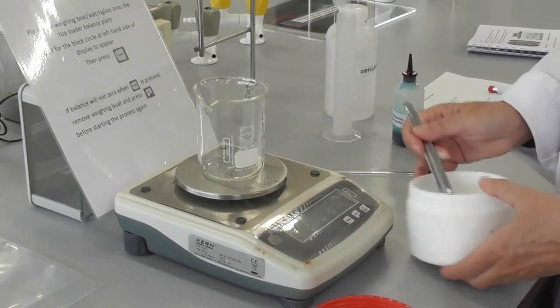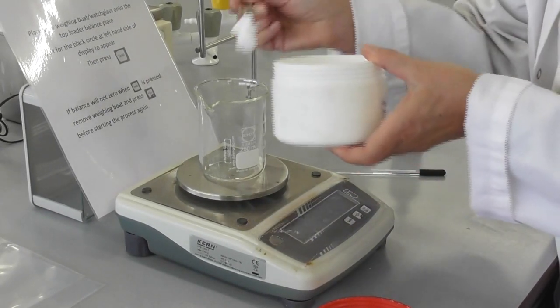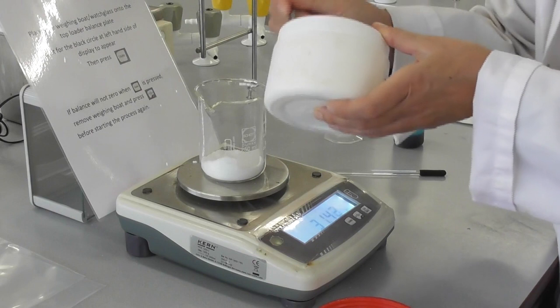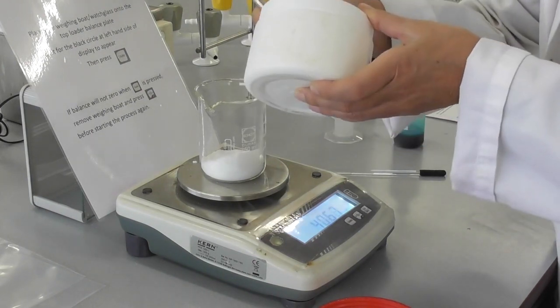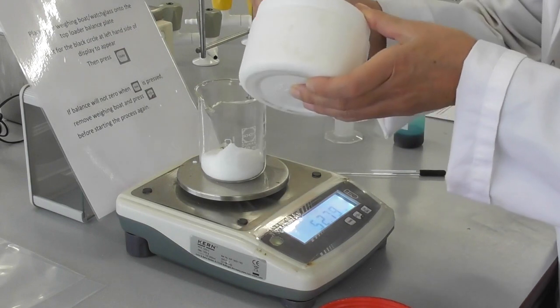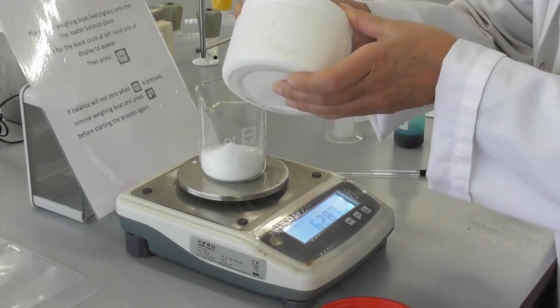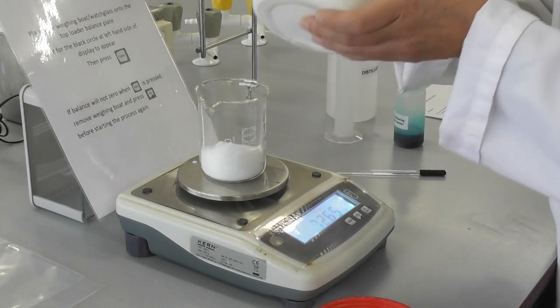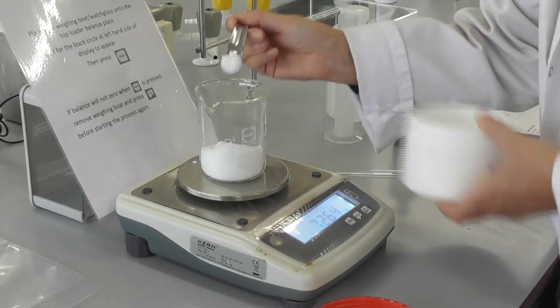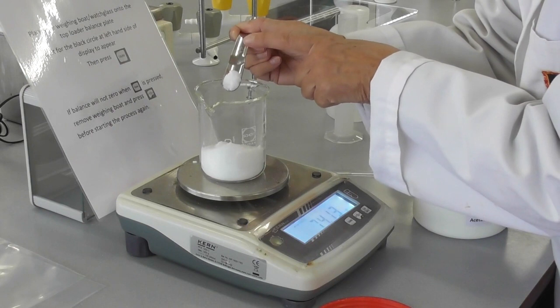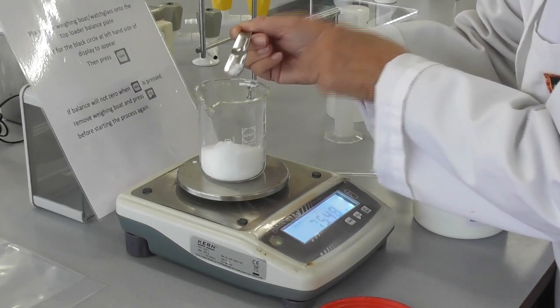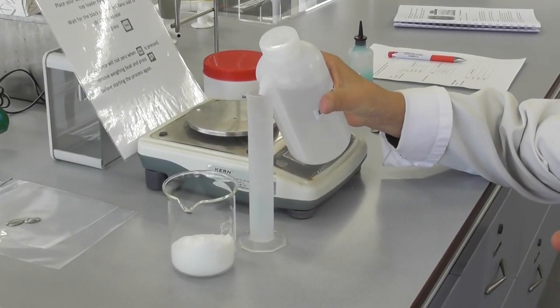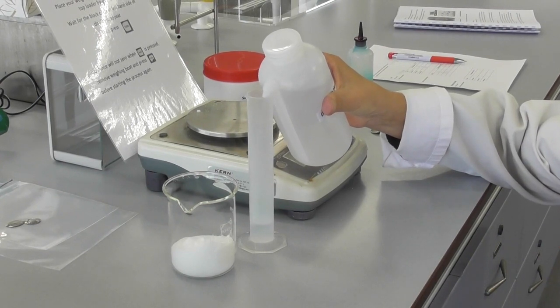We start by weighing out 75 grams of sodium acetate into a 250 ml beaker. Next, we measure out 25 ml of distilled water.